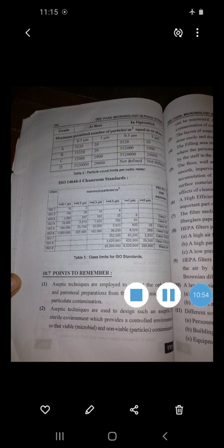Then dehydrated media may be used, provided the resulting media have equal or better growth promoting properties and give a similar standard curve response.